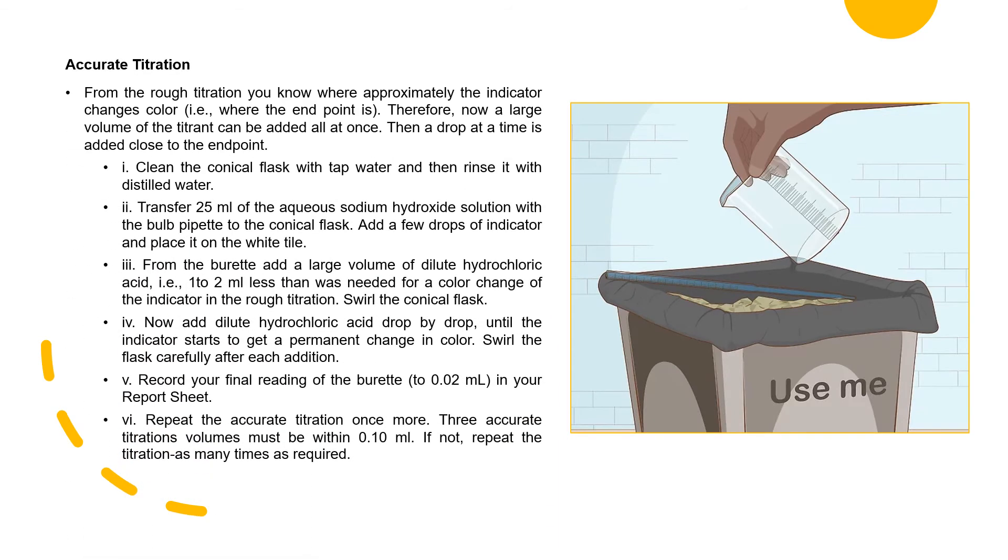For the accurate titration, from the rough titration, you know where approximately the indicator will change the color. Therefore, now a large volume of titrant can be added all at once and then a drop at a time is added close to the end point. Clean the conical flask with tap water and then rinse it with distilled water. Transfer 25 ml of aqueous sodium hydroxide solution with bulb pipette to the conical flask. Add a few drops of indicator and place it on the white tile. From the burette, add a large volume of dilute hydrochloric acid, e.g. 1-2 ml less than was needed for a color change of the indicator in rough titration. Then swirl the conical flask.